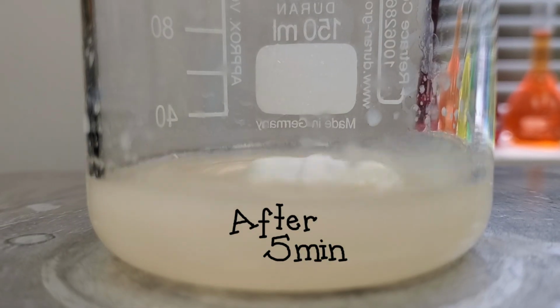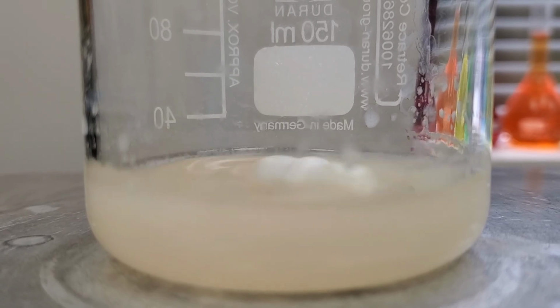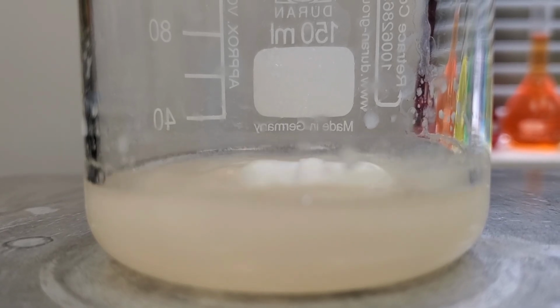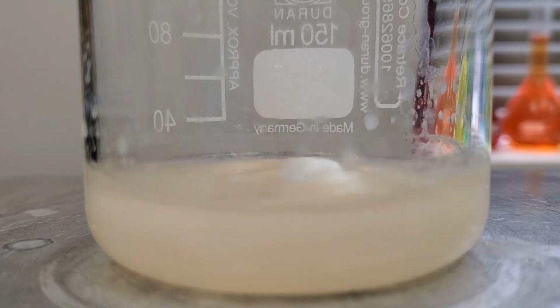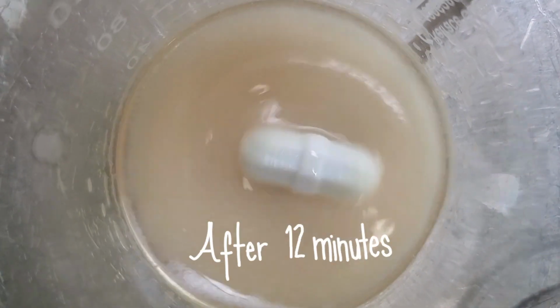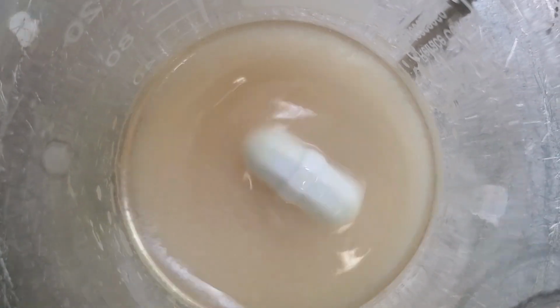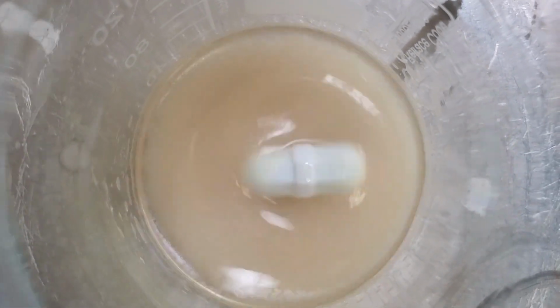and yellow. After the reaction was complete, I isolated the crude product by filtration and washed it with cold water to remove residual base and soluble impurities. At this point, the crude material already showed the expected yellow color associated with conjugated products like dibenzalacetone.